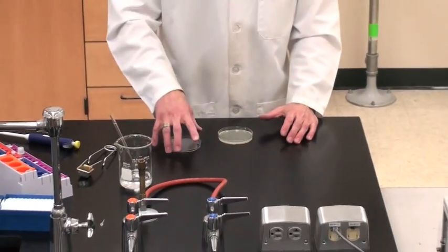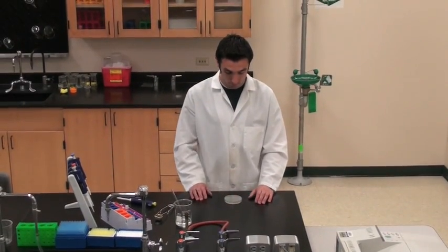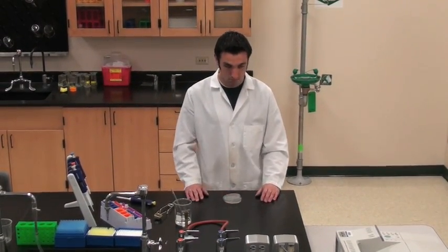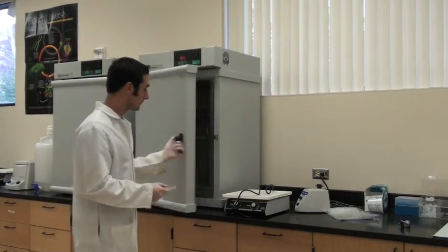Allow the plate to dry with the lid partially off the plate. Place the plate upside down in the incubator.